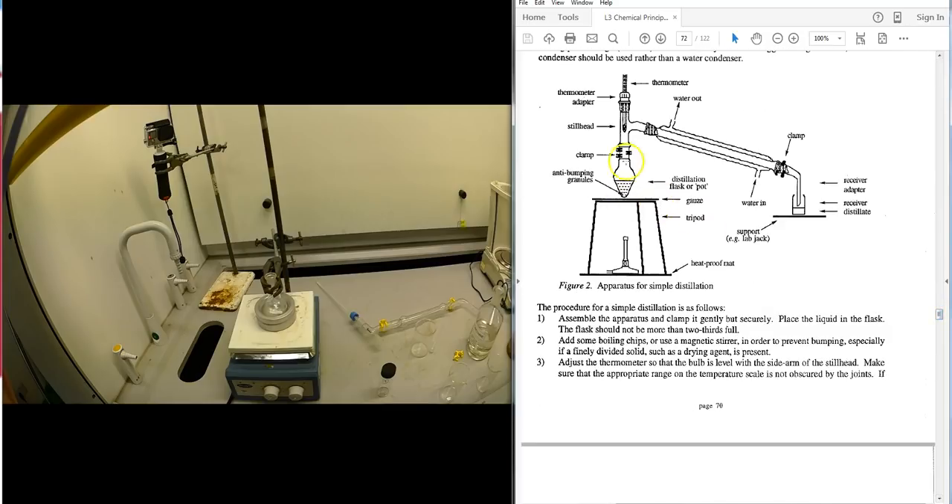For the distillation setup, a heating mantle replaces the old Bunsen burner and gauze method. A round bottom or pear-shaped flask is used with anti-bumping granules or a magnetic flea. The still head, thermometer with adapter, and condenser are all clipped together. Note that the thermometer bulb should be positioned at the middle part of the still head where it meets the condenser.